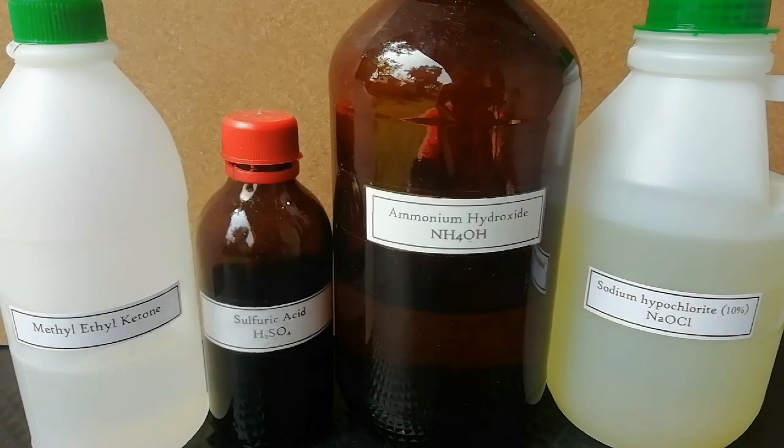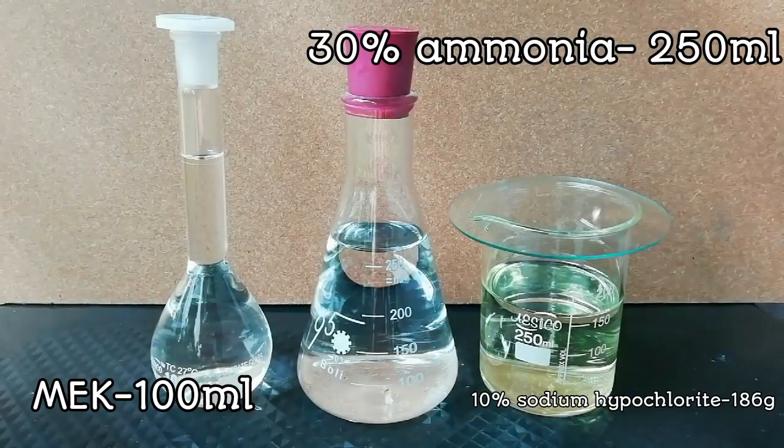30% ammonia, 10% sodium hypochlorite, methyl ethyl ketone, and 98% concentrated sulfuric acid were used for this reaction.